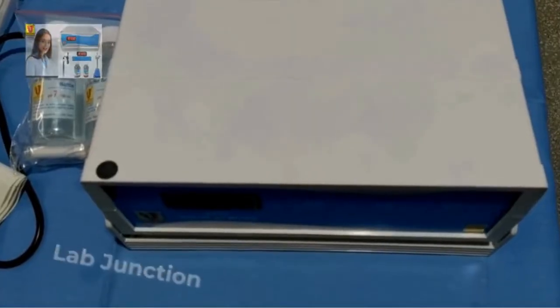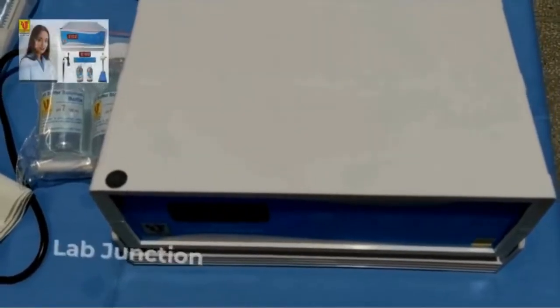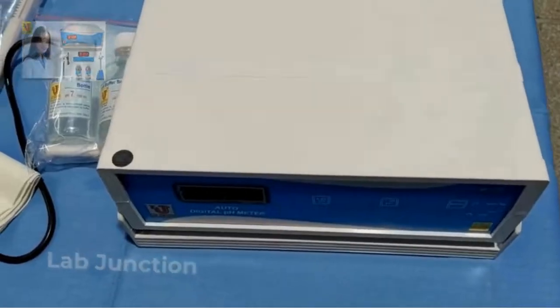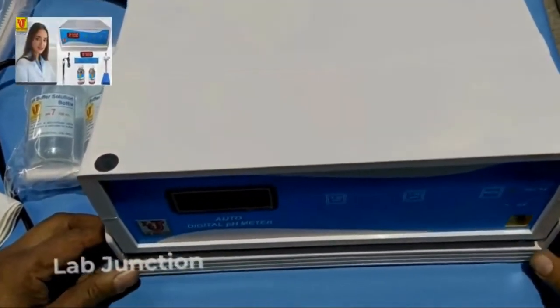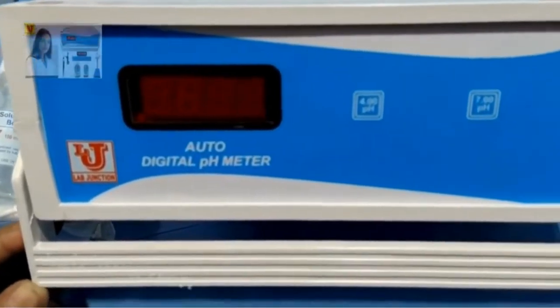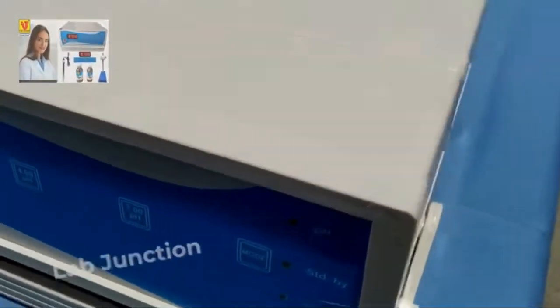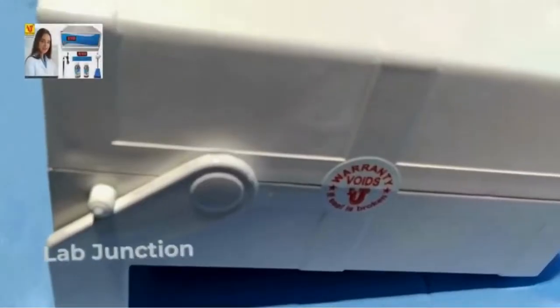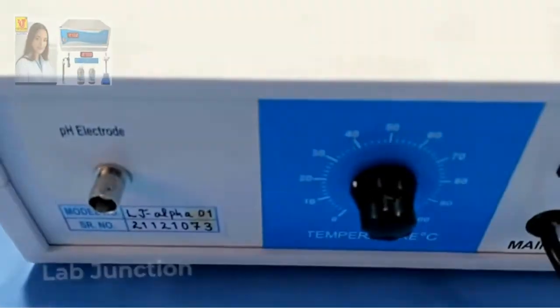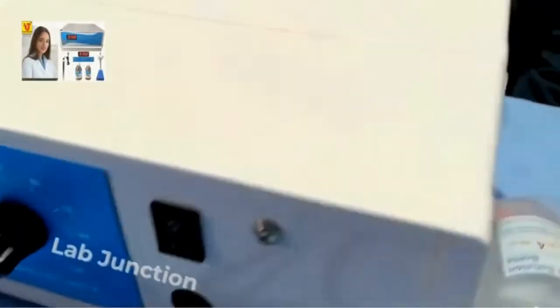Lab Junction's Auto Digital pH meter model LjAlpha01. This is our main instrument. This is the front view, side views, back view, and again side view.